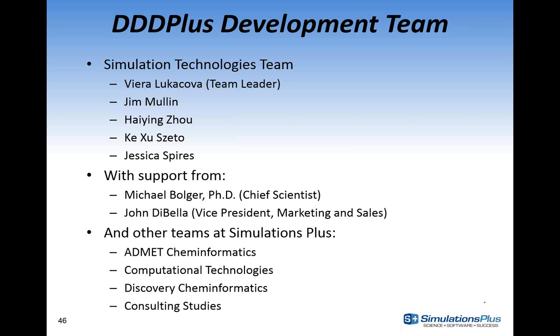Okay, thank you, Vieira. This is an interesting question. Is it planned to implement the Z-factor fitting in DDDPlus as it is already available in GastroPlus? Yes, that's a simple answer. I don't really have anything more to add, other than we plan on adding it, and it's probably one of the highest on the list of additions that we're definitely going to be adding in the next version.